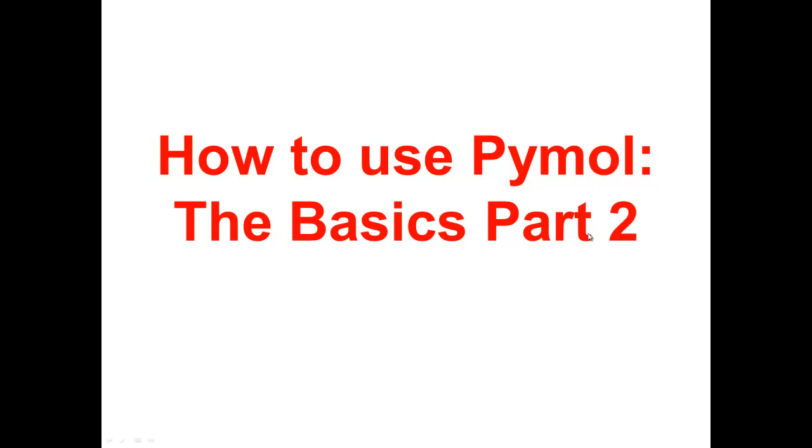Okay, we'll be using the same structure that we modified from part 1 of the video. If you want to be up to speed with what's going on, I recommend checking out part 1 first. However, it's not absolutely necessary because these techniques can be applied to any protein structure. Right, we're going to be focusing on the antibody and Ebola virus glycoprotein interface.